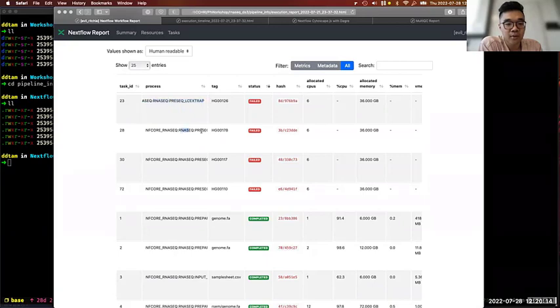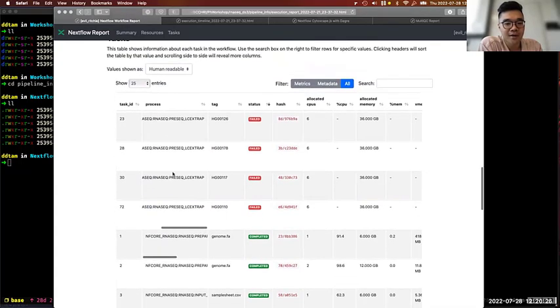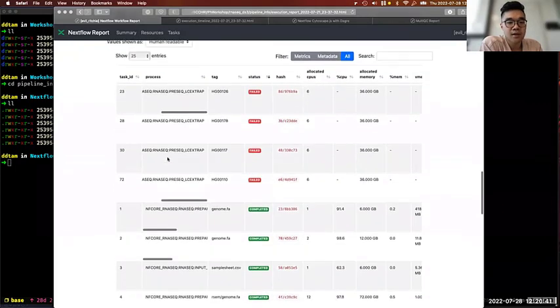And you can see that all of them that failed are this pre-seq LCEX trap. I believe this is a tool that attempts to rebuild transcripts. So it should fail because the toy data that I grabbed is just a very small segment of the genome in chromosome 2, and it just grabbed reads that overlap that small window. So there's probably a lot of broken reads, I think.